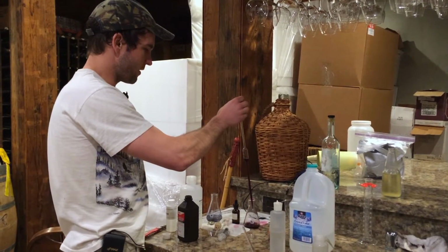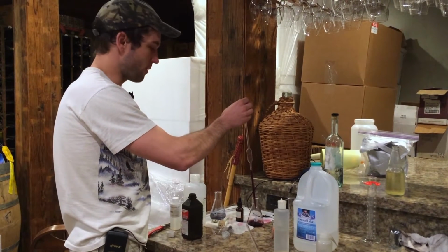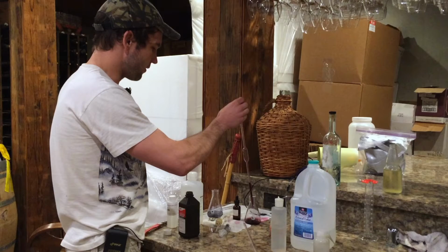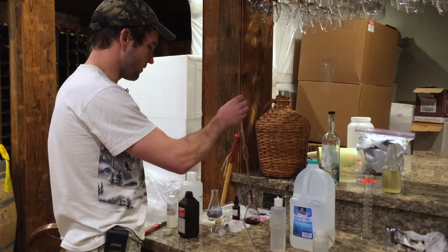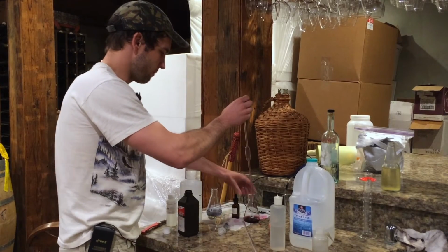And we got this test kit from More Flavor. They're all basically going to be pretty much the same. Doesn't really matter who you get it from. All work on the same principle, same tools, all about the same price too. So just get what works best for you.